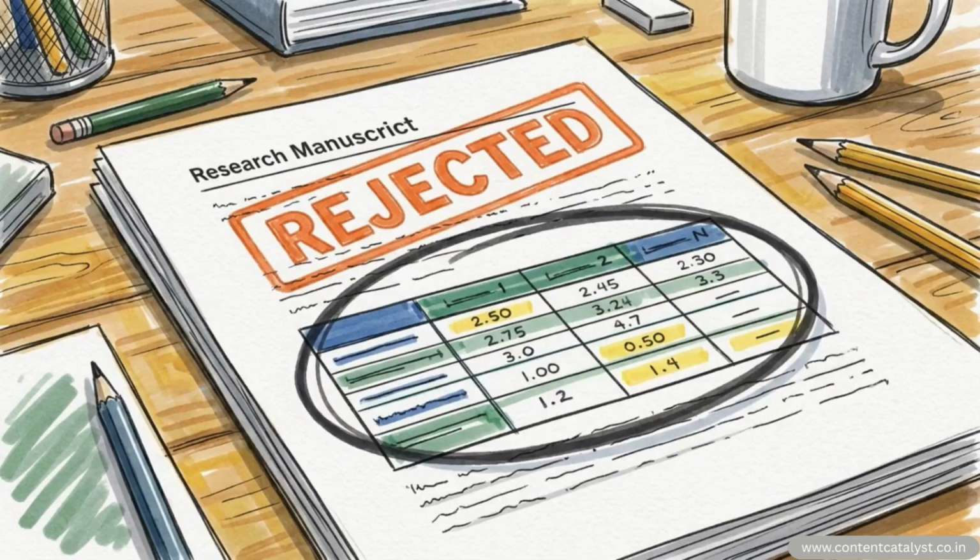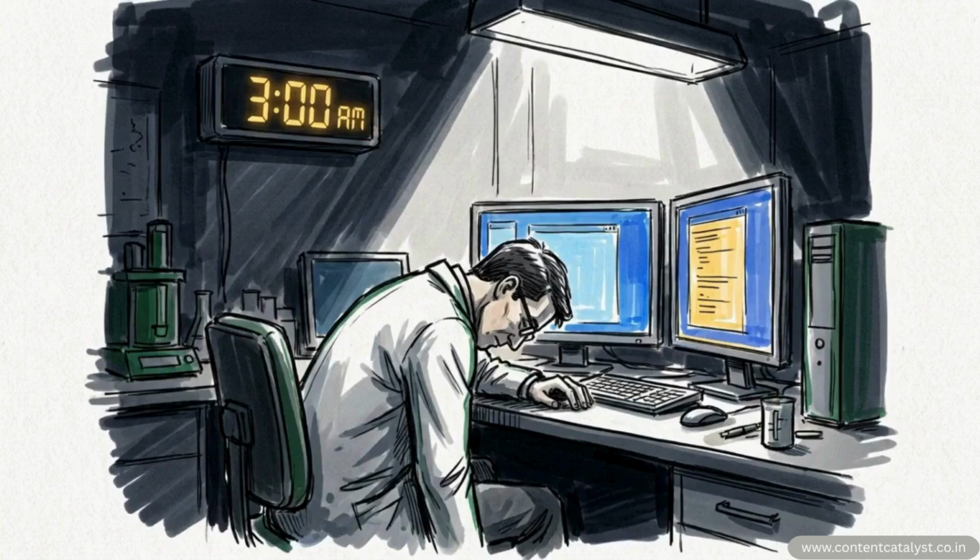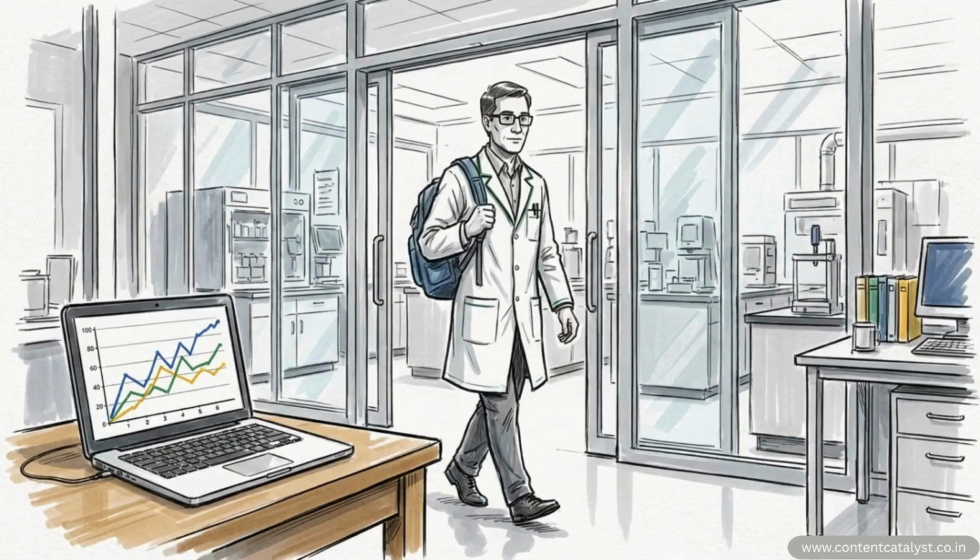In modern research, time is often your most scarce resource, even more so than grant money. GraphPad Prism is ultimately an investment designed to buy that time back.